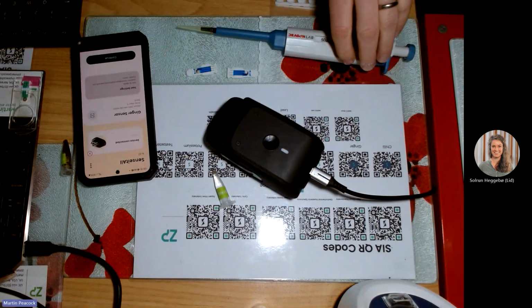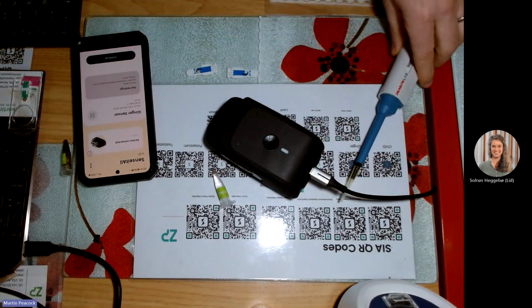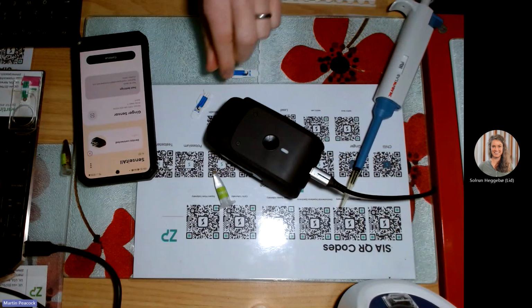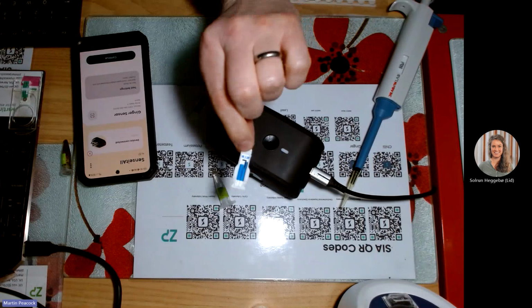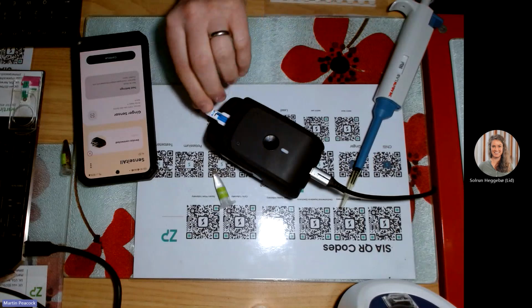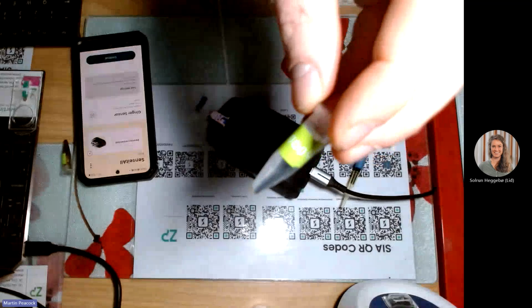Now, gingerol is, I wouldn't say so much benign. It could be quite pungent, but the safety assessment is slightly milder for using gingerol than it is for using resiniferatoxin. So I described that we would be using sensors. So I'll take the sensor. I'm going to take the sample. Now this is my sample.